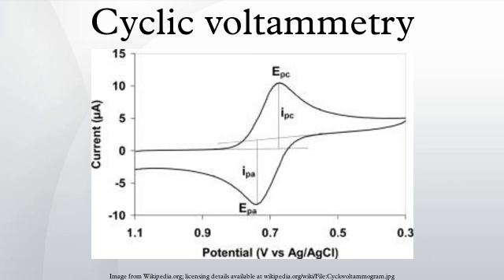The counter electrode, also known as the auxiliary or second electrode, can be any material that conducts current easily and will not react with the bulk solution. Reactions occurring at the counter electrode surface are unimportant as long as it continues to conduct current well. To maintain the observed current, the counter electrode will often oxidize or reduce the solvent or bulk electrolyte.